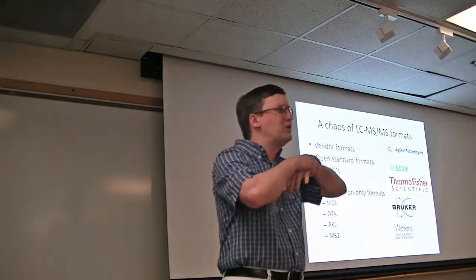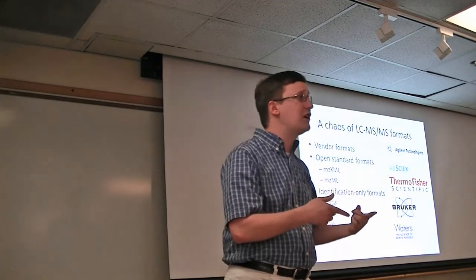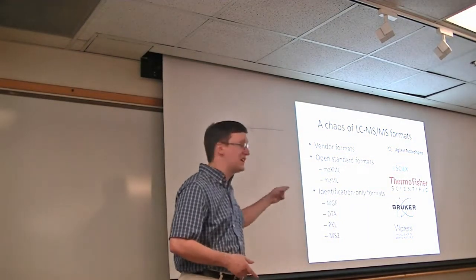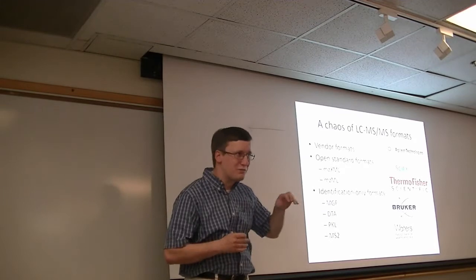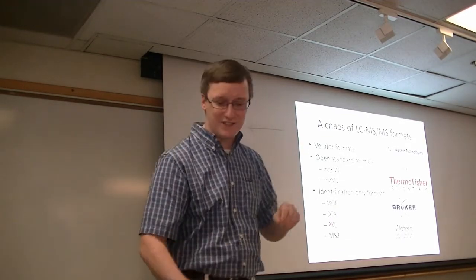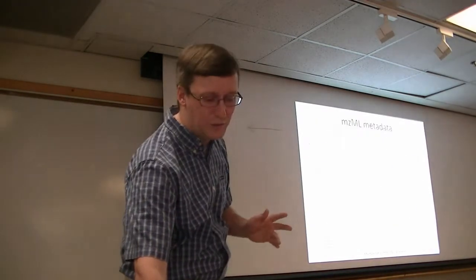So you can see there's this big proliferation of formats that have come from these. Being able to work among all of these different formats matters. Now, ProteoWizard does not directly support things like DTA and PKL files. Instead, it will create the mzML for you, and then another tool will create the DTAs and PKLs from the mzML formats. So it's a chaos, as you can see. Being able to deal equally well with all of them is important.